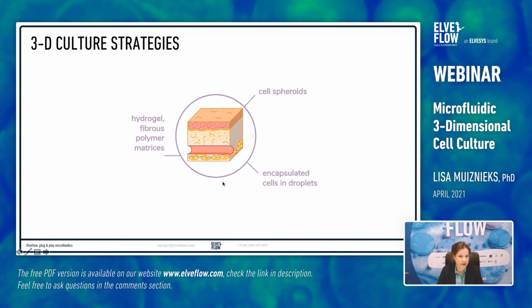There are many ways to produce a 3D cell culture environment. The main considerations are what matrix material to use, and if you start with the matrix or with the cells. The following description is by no means exhaustive, but we focus on setups that use and can benefit from microfluidics to make 3D culture models.